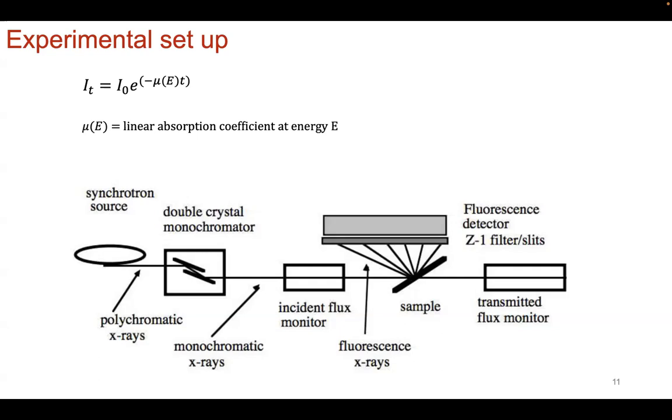What's also really interesting about this technique is that fluorescence is extremely sensitive. In fact, you can detect your own signal. When this signal comes out, sometimes it will also come back and you can detect the signal again, which is pretty interesting.